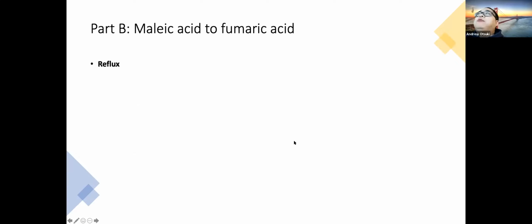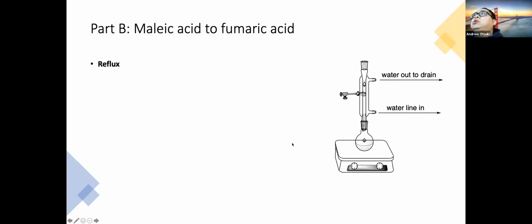So I don't think anyone knows what reflux is. Maybe you've heard of it before in other chemistry classes, or maybe by your own curiosity, but reflux is a way to generate heat to a reaction continuously over a long period of time. Yes, it's energy intensive. It wastes water.